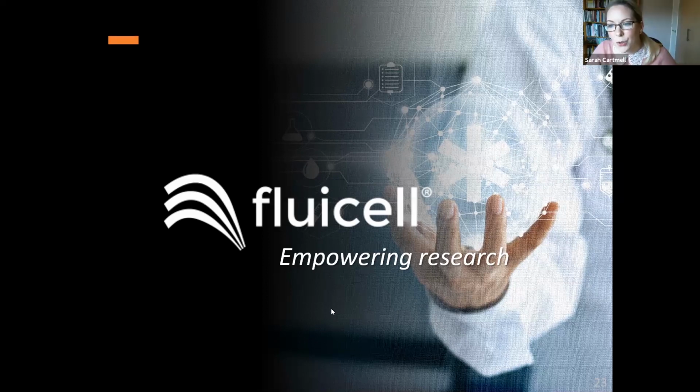Davide asked, do you think this technology could be used to replace animal models by producing small biologically viable tissue models, for example, with skin to study wound healing? Yes, it's definitely one of the areas that we have in focus. The big advantage being that you can use, let's say, human stem cells or differentiated stem cells to actually design human tissue instead of animal tissue.